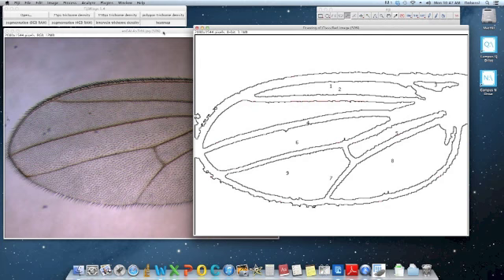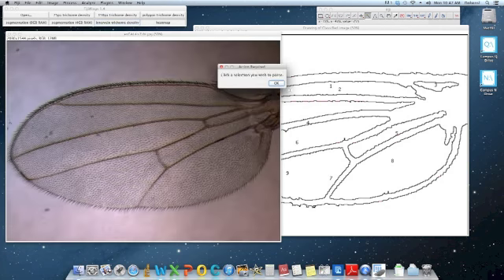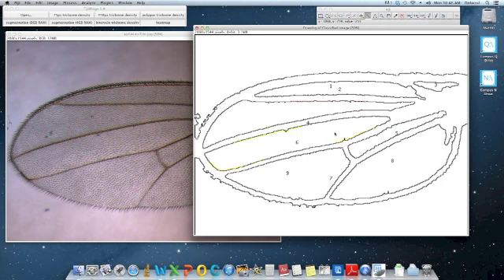Now, it's important to put this original reverted image up front. When you do that and click Intervein Trichome Density, you get a dialog box that asks you to select a region in this. So I'll do that by clicking here, and you can see that region is outlined in yellow.